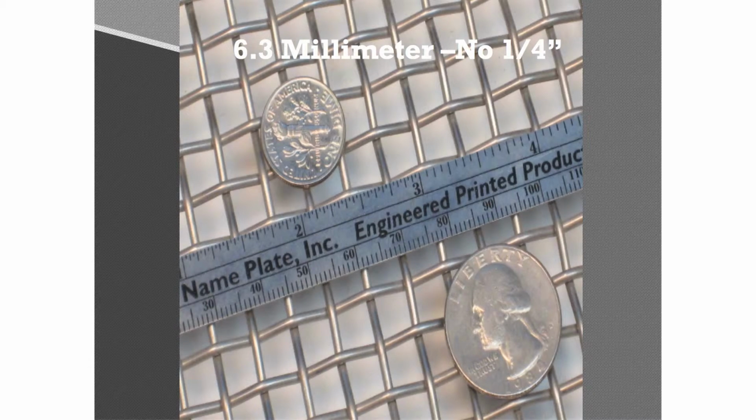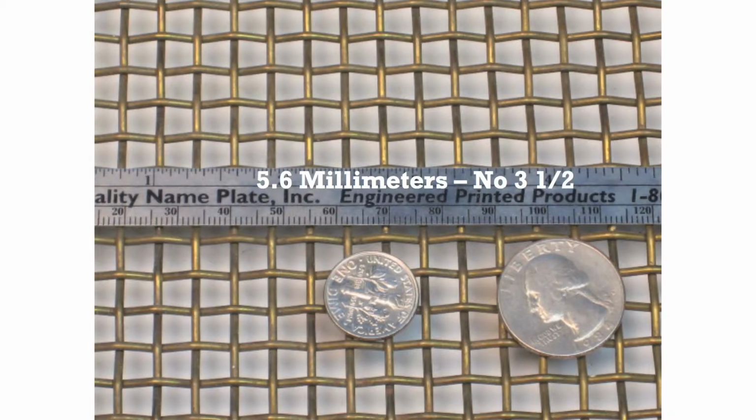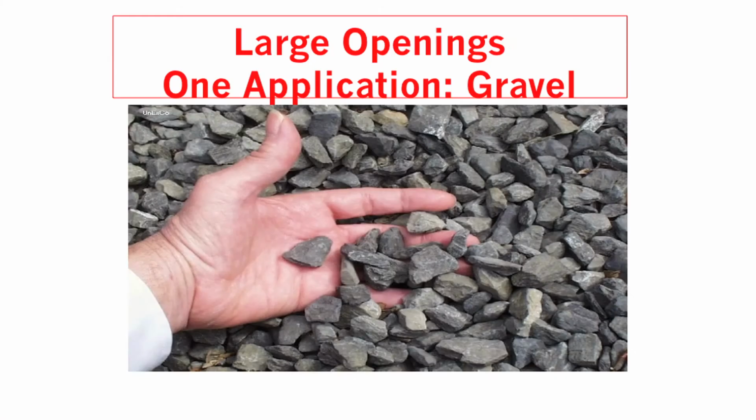When the hole sizes get smaller, the numbering convention changes to an alternate number starting at 3.5 for a 5.6 millimeter sieve and ending with the number 635 for a 20 micron sieve. Yes, the number increases as the size decreases. By the way, a 20 micron sieve is at the limit of woven wire mesh potential.